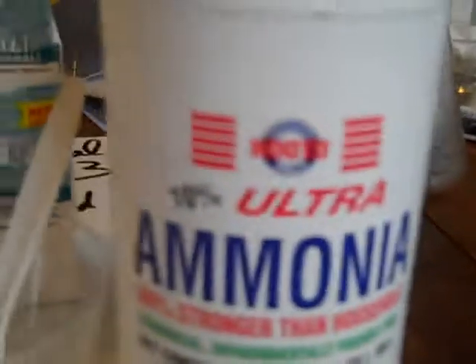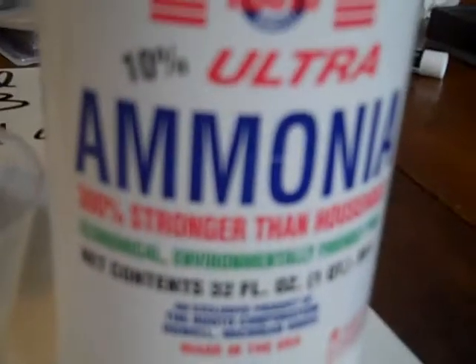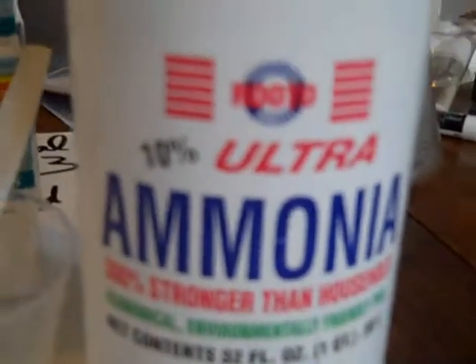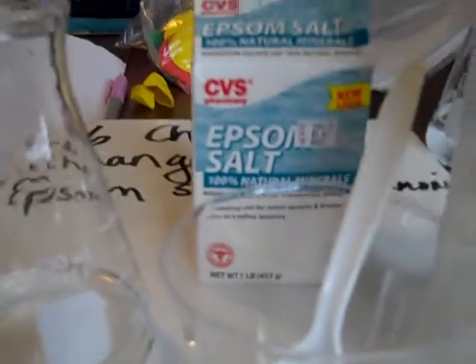Ammonia can be dangerous — it's a good cleaner and very environmentally friendly, but you have to watch the fumes. You must never use ammonia and bleach together; you will create a toxic gas that could kill you. Because of the ammonia, I'm going to put on some goggles.